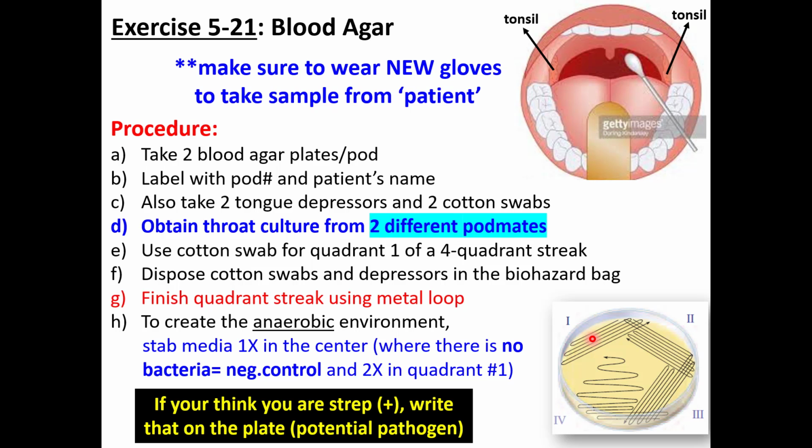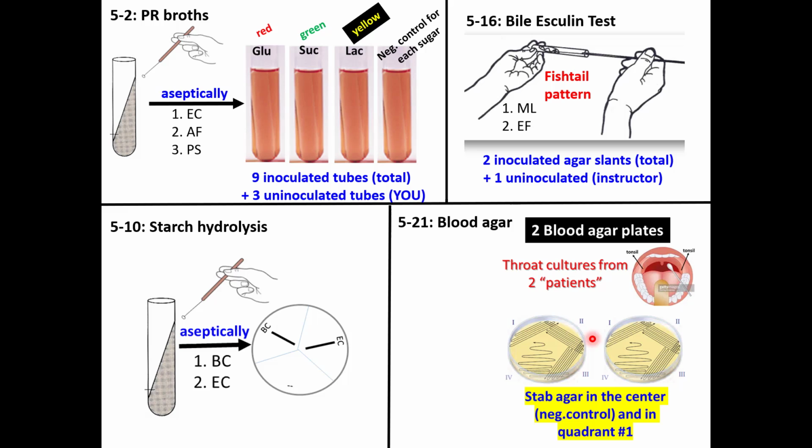Eventually, if you had an infection going on that you are aware of, we would be even more careful and write this on the plate, just in case someone opens the plate by accident. It's always good to be careful.